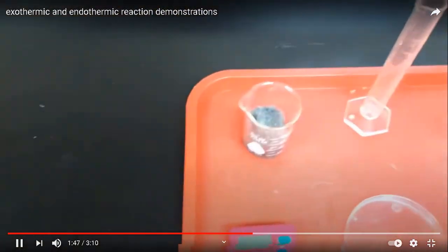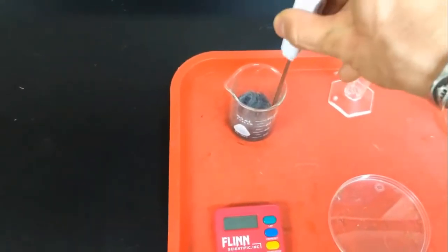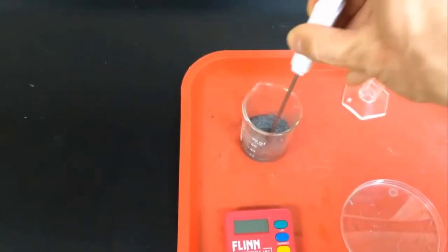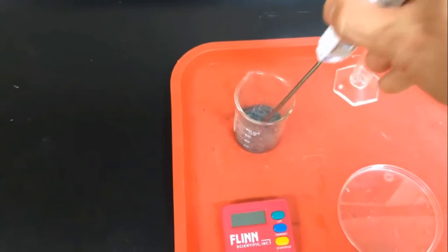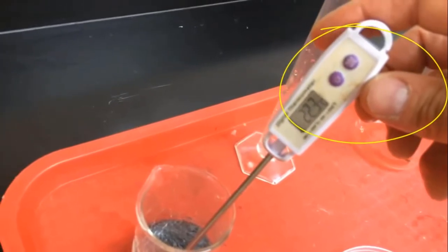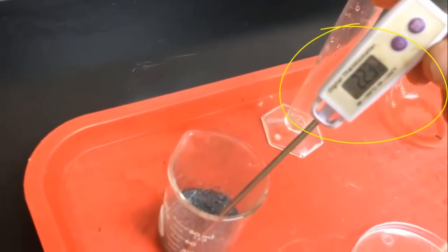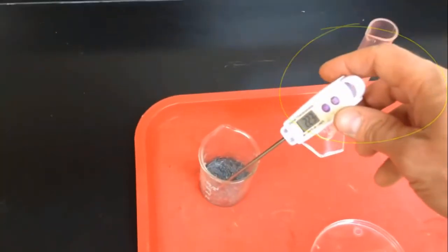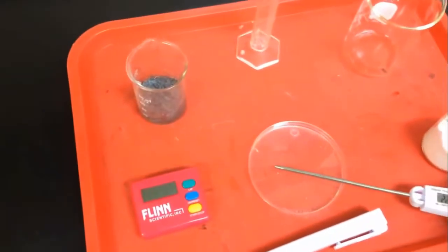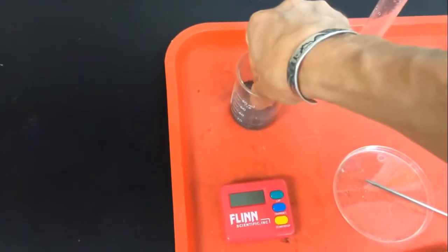They added this here to the vinegar. Also, they measured the temperature. They measured after, 22.3. You have to know which one is exothermic, which one is endothermic, and you can do this experiment at your home. If you have a thermometer and you have a balance, you can use these things at your home.